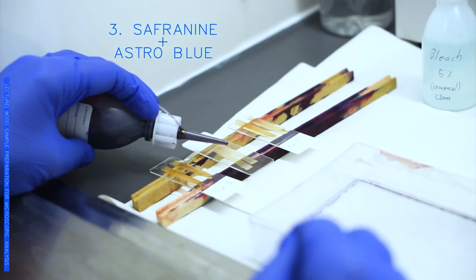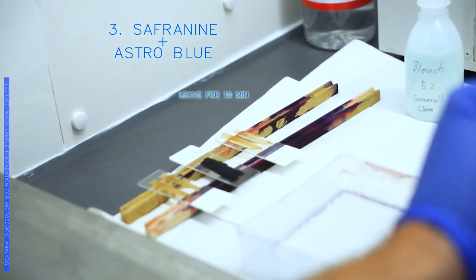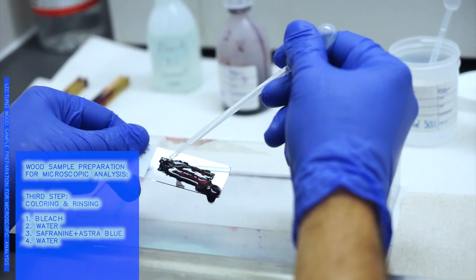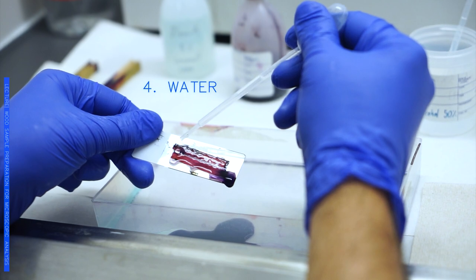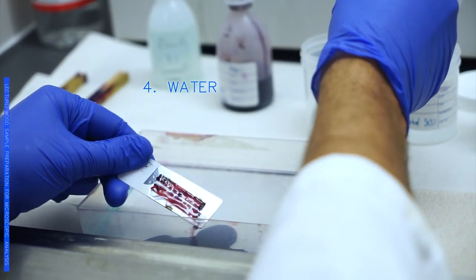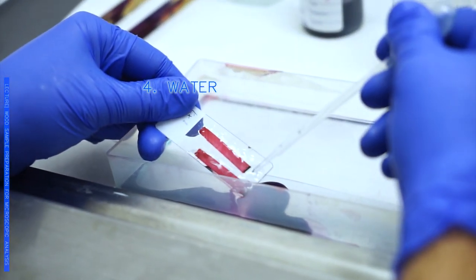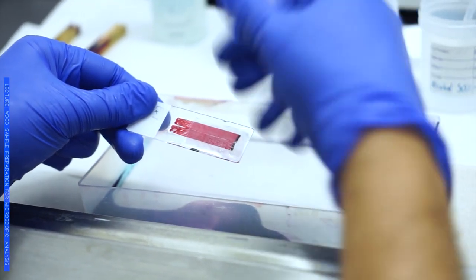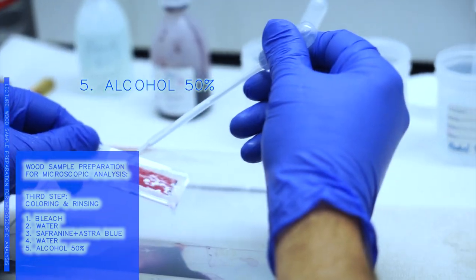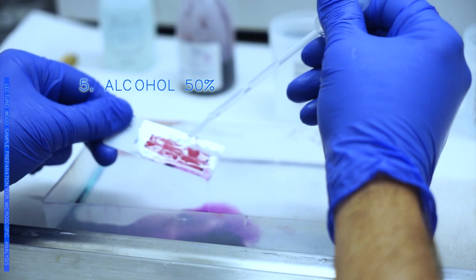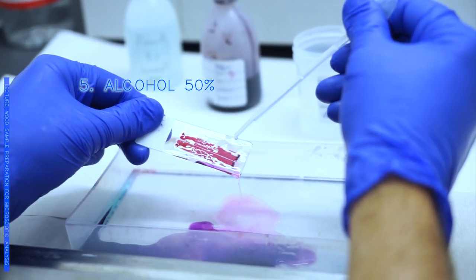Once we have already had our samples around 10 minutes on Safranine, we will start washing it with water to get the excess out. Once we get most of the excess Safranine out, I use a small piece of paper tissue to block our sample so that they will not be moving around. We start washing it with alcohol 50%. Even though it seems that we have already cleaned it, the water will still bring out a lot of the colorant and we will have to do this for a couple of minutes.